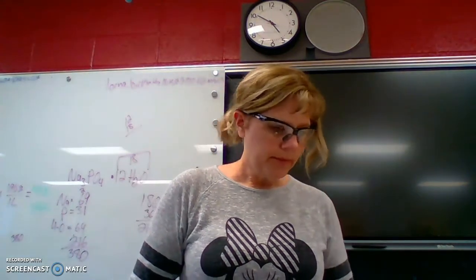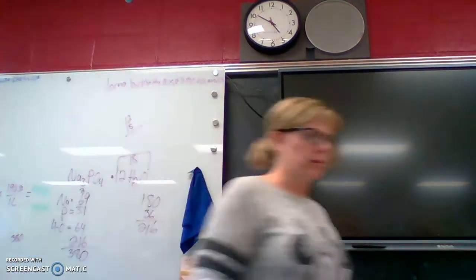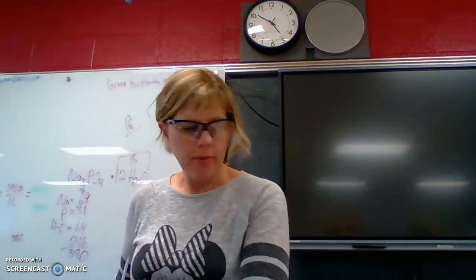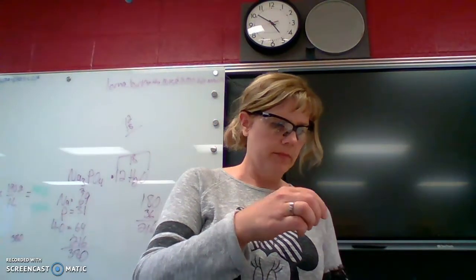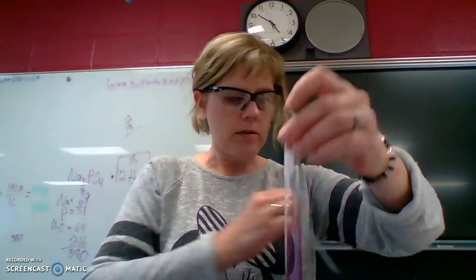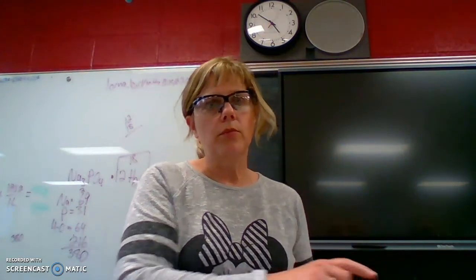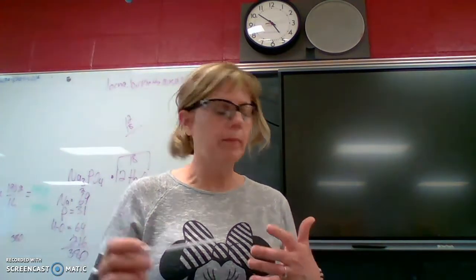All right. Then it says to add a drop of phenolphthalein indicator. Grab another clean barrel type pipette. So it says add a drop of phenolphthalein. Just a couple drops. Oh, did you see what happened even when I didn't even get it in there? Just on the edge. See that beautiful pink? So what we had in here was sodium hydroxide, which is the base. So the important observation is, what did you see happen when you added phenolphthalein to the base? We saw this beautiful bright pink color.